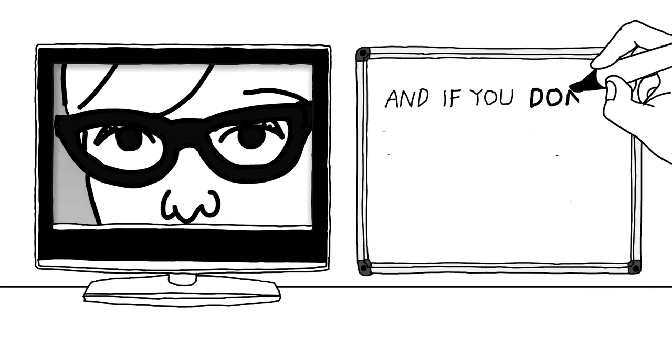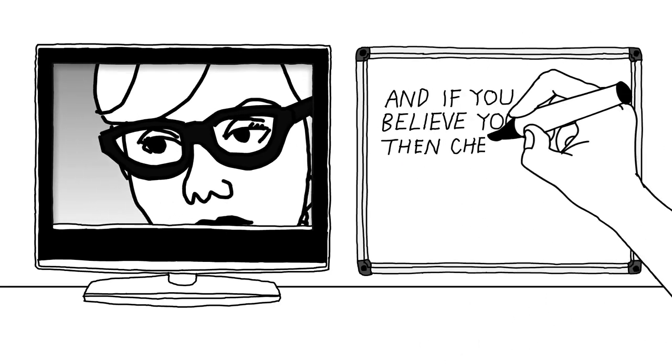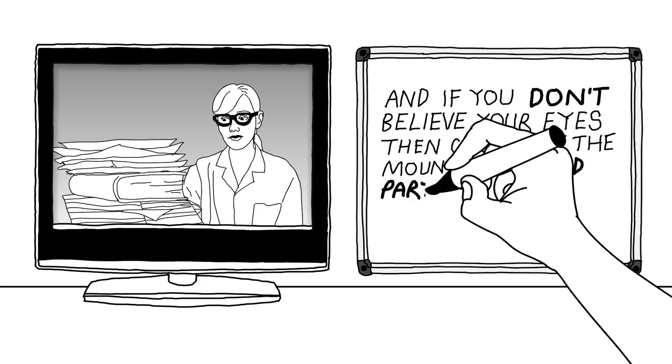And if you don't believe your eyes, then check out the mountain of third-party papers citing Nanosight.